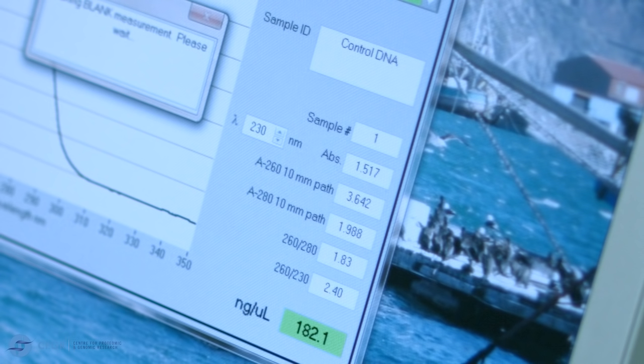The next thing we are going to do is to assess the DNA integrity, and the samples will be run on a 1% agarose gel. Loading buffer is added to each sample, including the DNA ladder, which will be used to run alongside the samples.